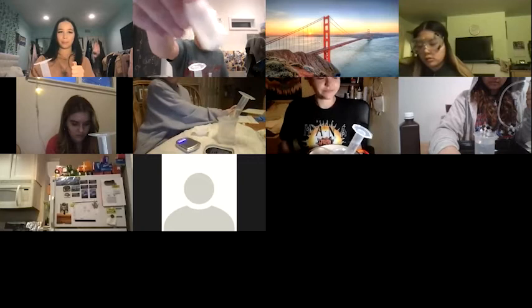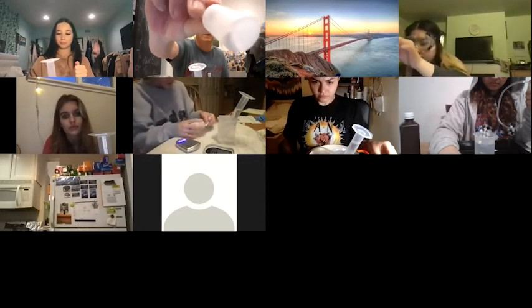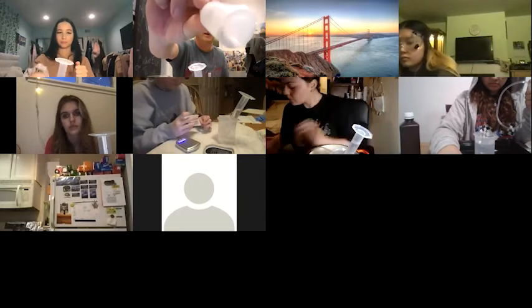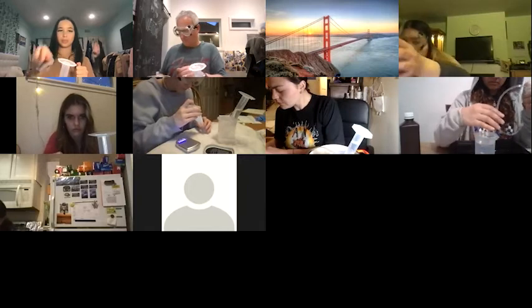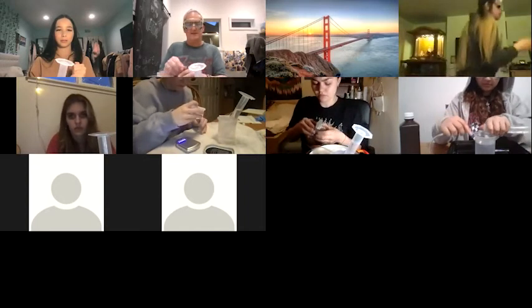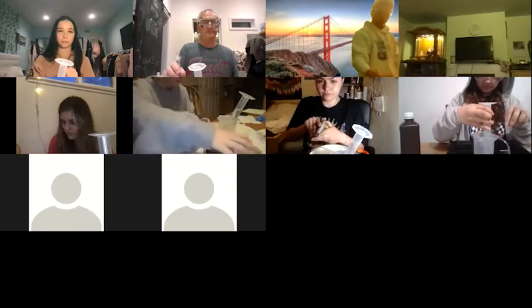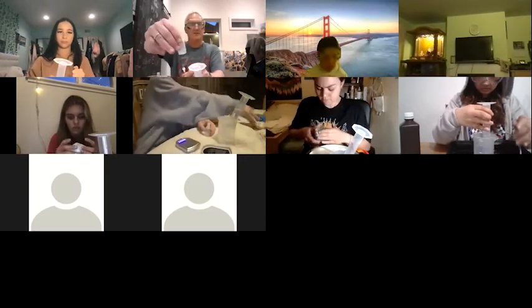Yes, you can see it's basically a tiny bit of yeast in the bottom of this thing. That's really all you need. What do we do with the other side of the tube, the one that we're holding? Oh, that just comes out. And this is what we're going to attach to the top of this.